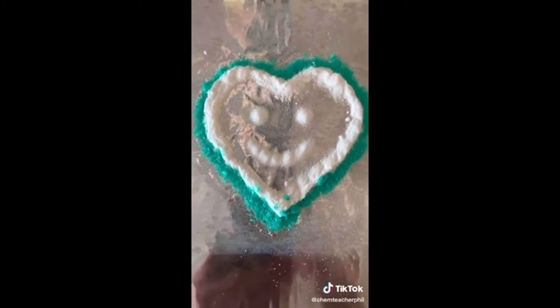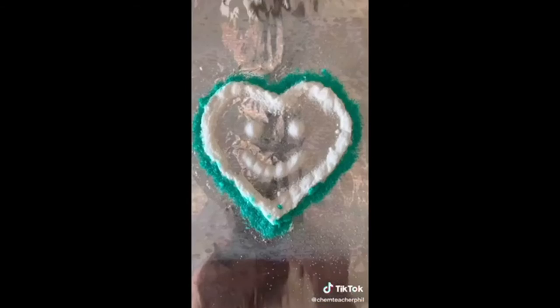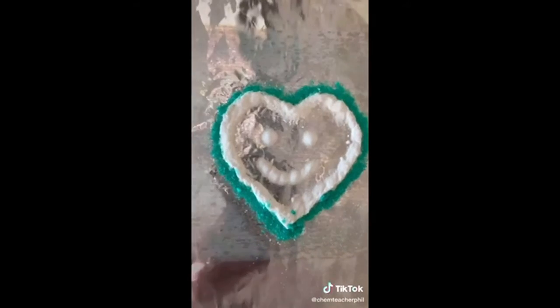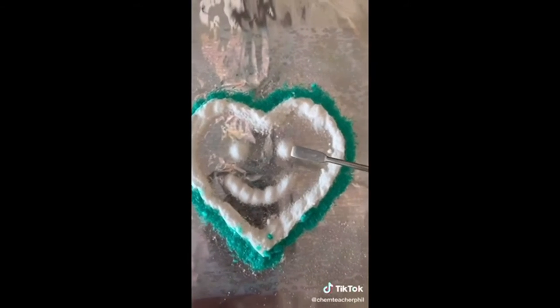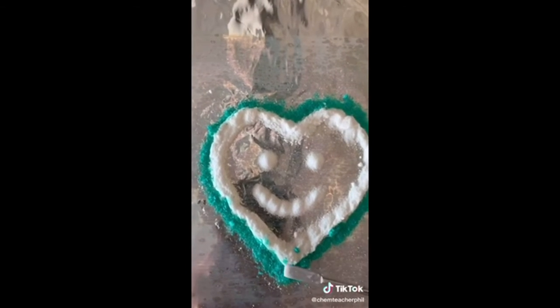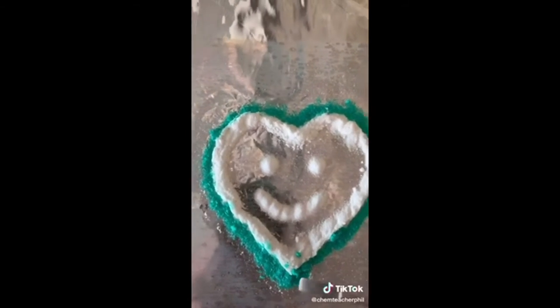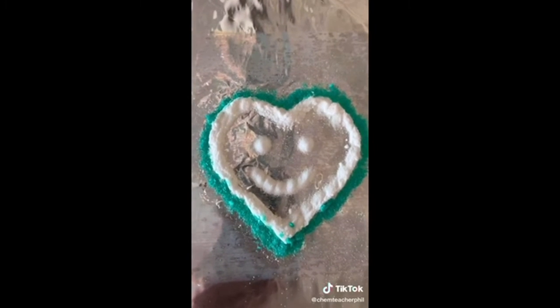I came up with this, and this is my class. Renegades! So here's what's going on with this smiley heart. We've got baking soda for the eyes and the mouth, lithium chloride around the perimeter of the heart, and then a copper chloride rim. We're going to put some methanol on it, and then we're going to ignite it.